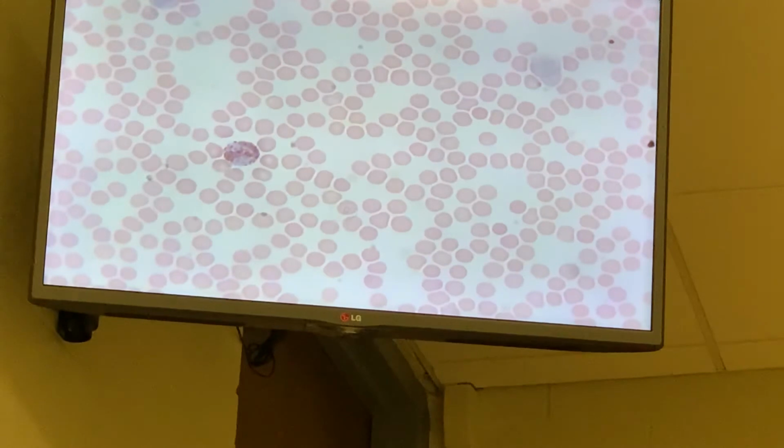This is where you need to really look at the characteristics of the cells, because when you're looking at this, you see these little dark blue specks. You're not going to see that with a neutrophil. With a neutrophil, you're going to have the dark purple nucleus that's in lobes that look strange. I'll see if I can find another neutrophil and you can compare. You said that's an artifact? Yeah, you see that sometimes.